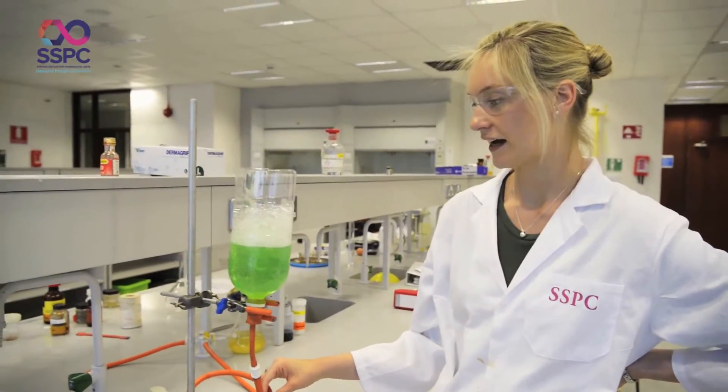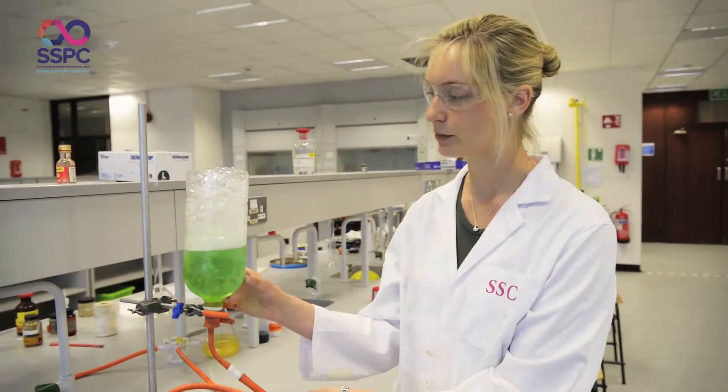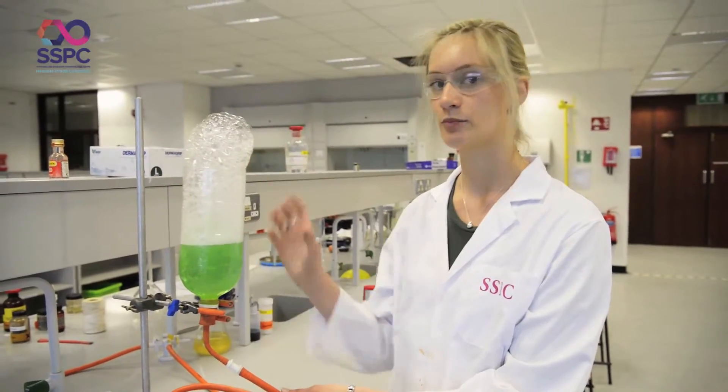So I switch on the gas — this is our methane gas supply — and the gas bubbles up through your washing up liquid and water solution, creating bubbles.